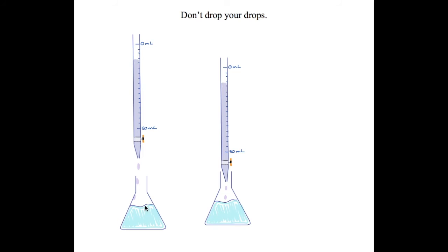One thing that I see as a problem in the lab occasionally is that people will have their burette set up way higher than their flask and the solution in their flask. So what ends up happening is when you swirl this flask, occasionally you'll miss a drop. It might fall into your flask, but it falls along the walls of your flask and accumulates on the sides rather than entering your solution and mixing properly. So these end up being lost drops of titrant.